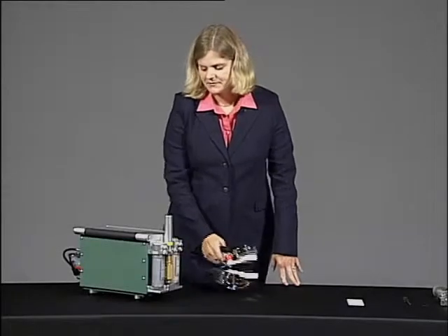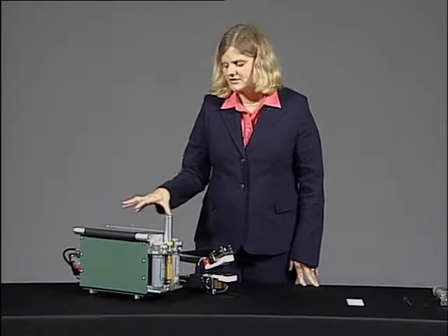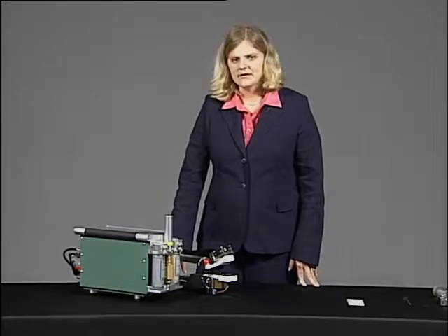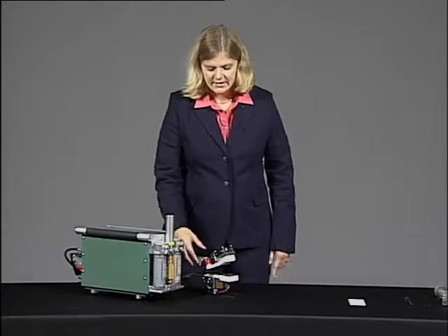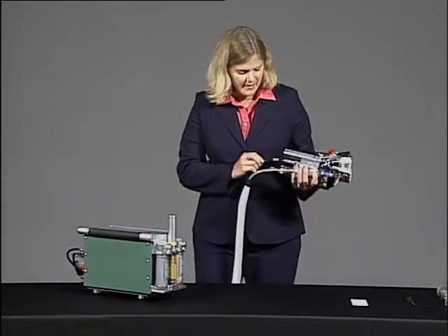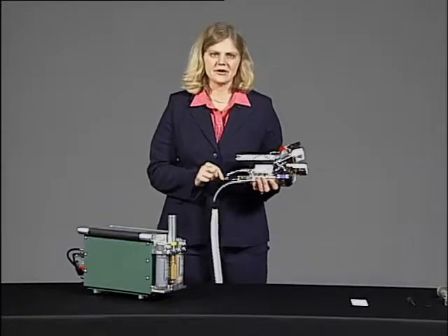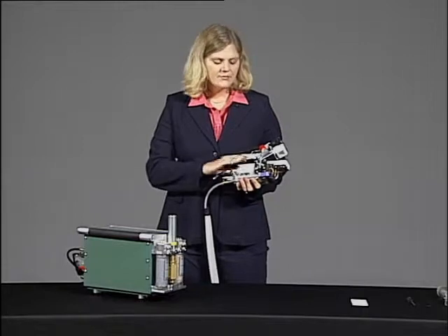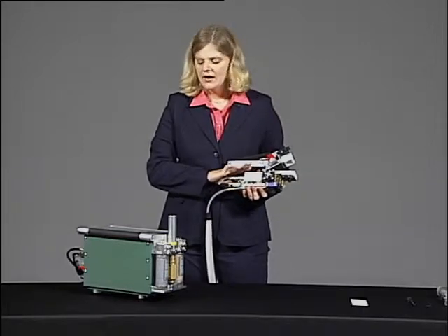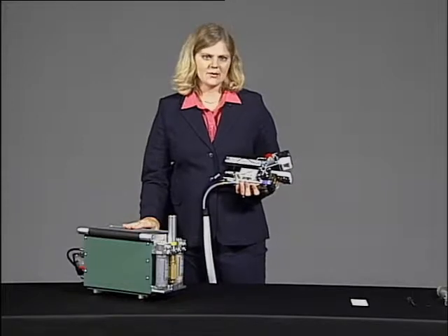When you load the software for the first time, the onboard instructions will ask you if the chamber ERGA cable is connected. And the cable that is referring to is this round connector. And this round connector carries all of the power for your infrared gas analyzers. And you want to make sure to have that cable connected before you answer this question.